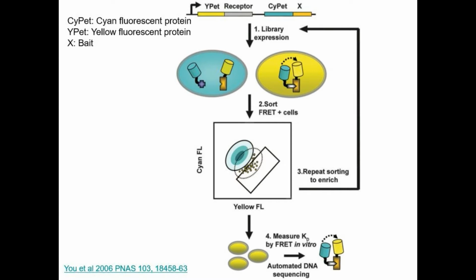So let's begin. Basically, you try to excite your bait protein, after sending it UV light. So your bait protein will try to emit short wavelengths. The prey protein, if it is very close to the bait, will be excited by this light and it will emit a longer wavelength. So they need to be in close proximity and/or bound to each other in order to express the secondary wavelength that we want to see.